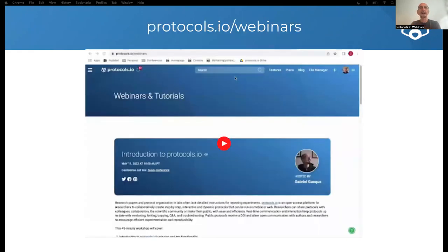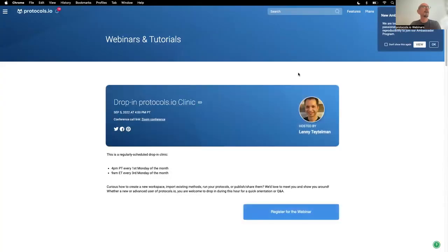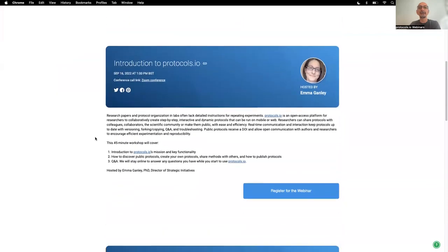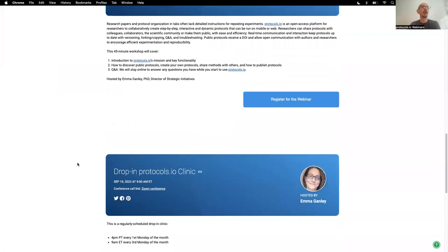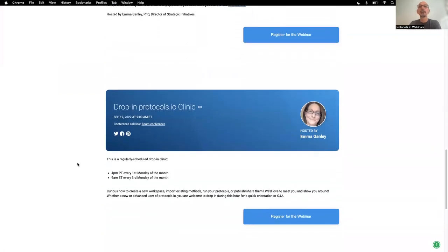So I'm going to open a website on the internet. So this is protocols.io/webinars. And you can see in this website the list of upcoming webinars. We also have drop-in clinics, which are user-driven sessions for questions and for which registration or appointments are not required. You just look them up in the calendar and show up.